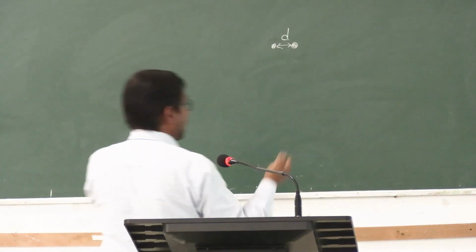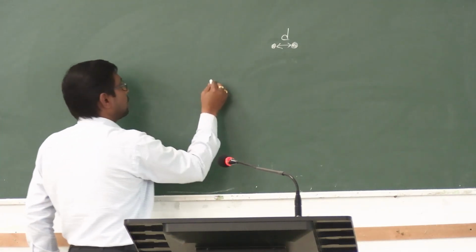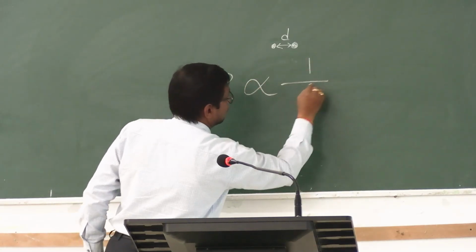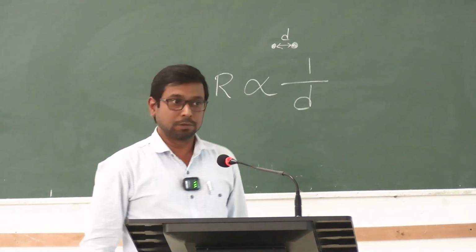Now I will go through some mathematical calculation. The resolution R is inversely proportional to D, the limit of resolution.